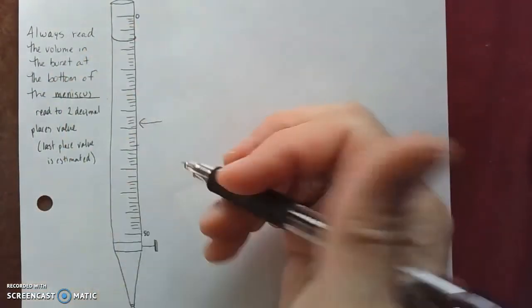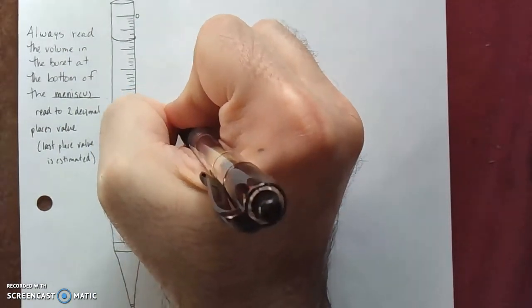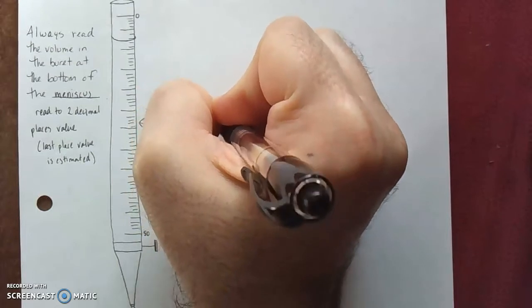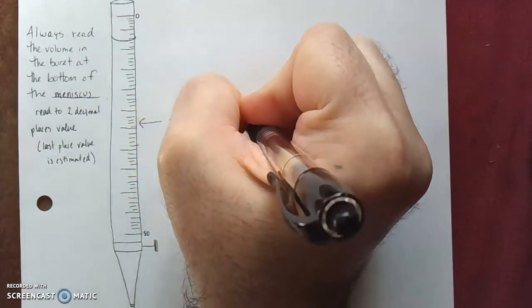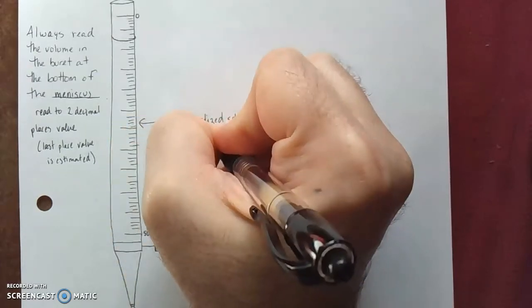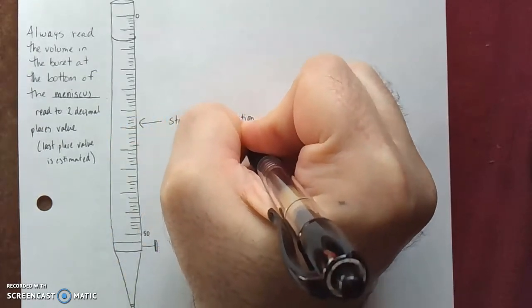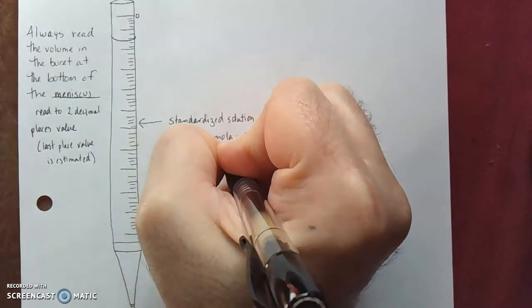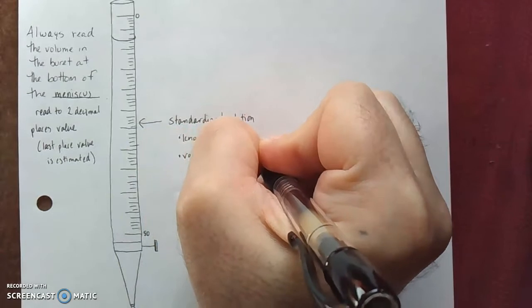So inside this burette is a standardized solution, which means that it is of known molarity, and the volume used will be recorded.